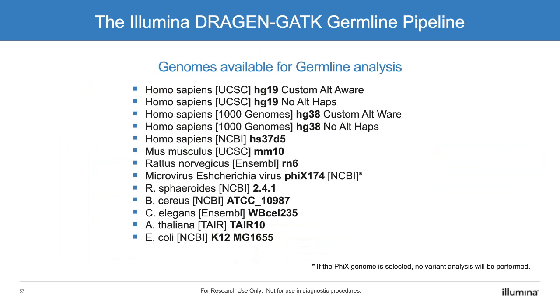So here's just a list of the pre-built genomes that are going to be available for selection under the Germline analysis.